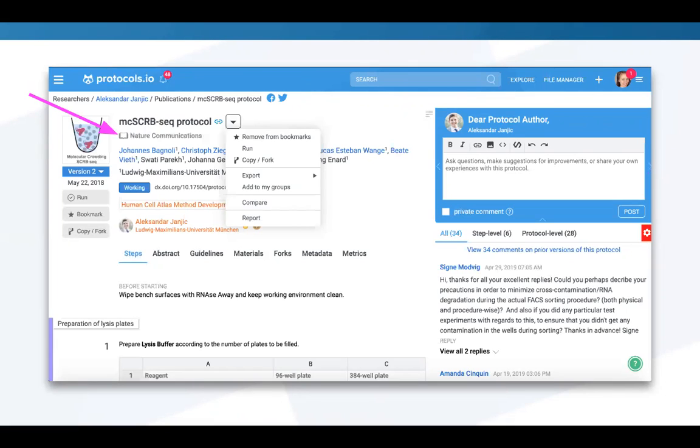And then all the protocols that are published can be linked to a publication. So this, for example, is a protocol that belongs to a Nature publication. And also the protocols themselves, as they're public, become a publication, so they get a DOI. And here we have a little indication of the status of the protocol. So you can see, is this protocol working? Is this something that is in development? Maybe it's something somebody even attempted and it didn't work. So there's a status. Also, we have something called versioning.